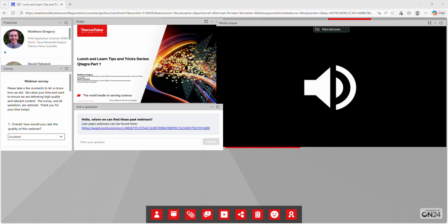Yeah, no, that's fine. So it slightly changed how we do the auto peak in the Pro software. We've taken it more global. David did a bit of a demonstration on the modes and the tune sets. So now the auto peak is specific to a tune set. Really, the first time you use a particular wavelength in a tune set, we auto peak it, and then we don't really need to do it thereafter.